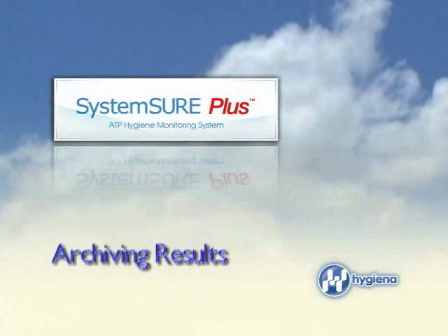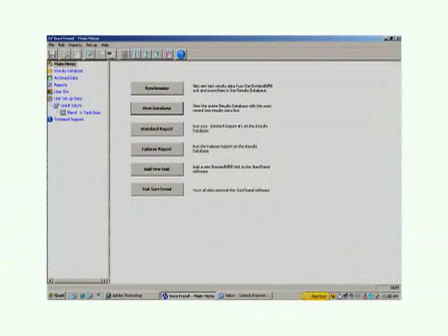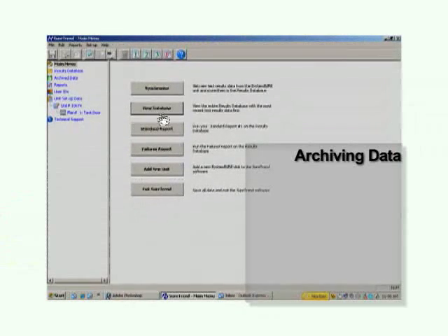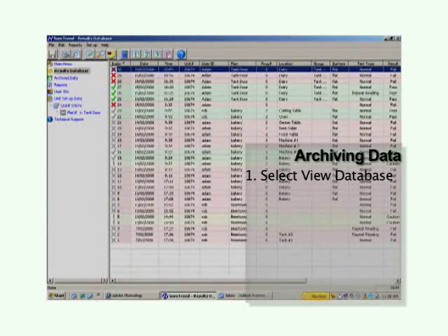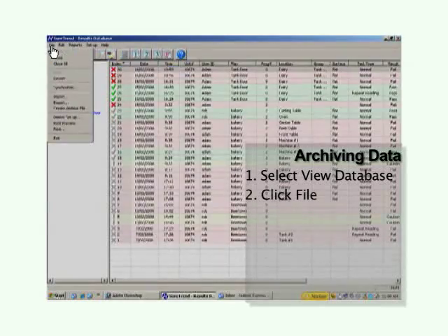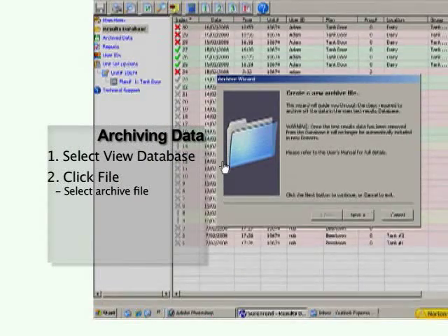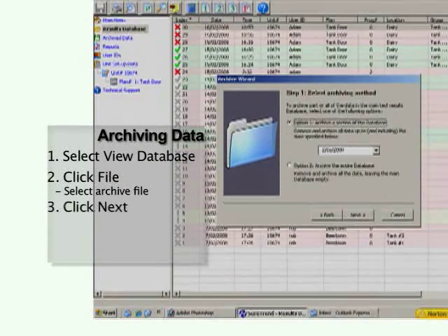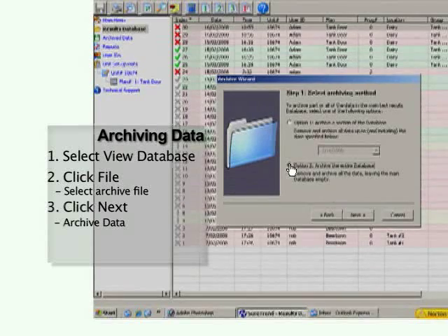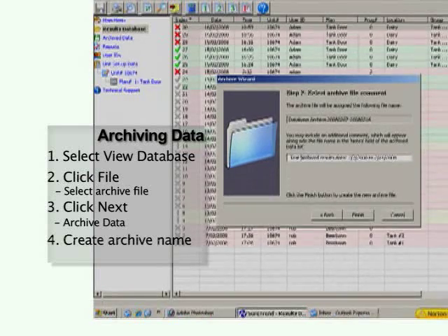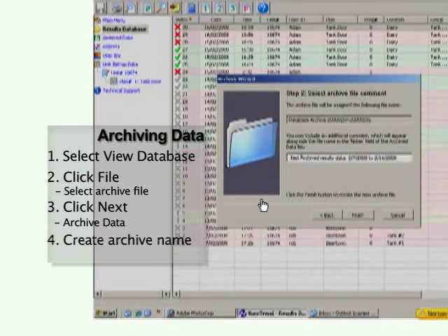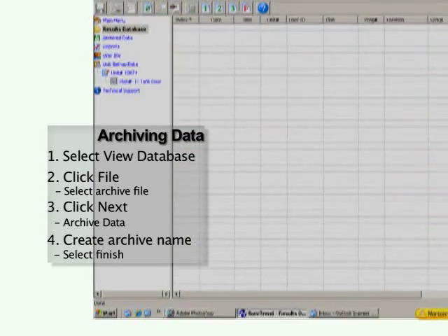To clear your results database of recent tests, from the main menu simply click View Database. From here, click File and select Archive File. A Create Archive File screen will pop up. Click Next and you will then have the option to archive the entire database or a selected section. In this case, we will select Entire Database. It then brings us to naming the archived data. Select an appropriate name, add notes if needed, and then select the Finish button. The results database is now clear.